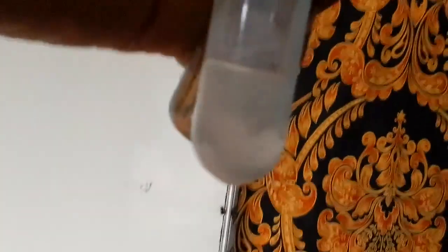Examine the white very well. This white is chalky. It's different from the white we observed in the previous test on D. That white was gelatinous, but this white is chalky in appearance.